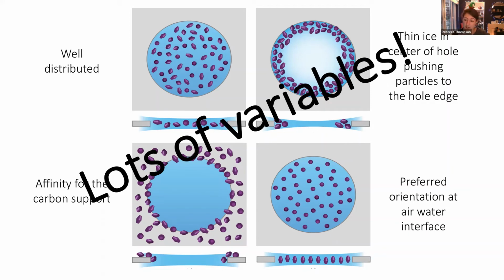And that's the advantage of accessing cryo-electron microscopy through something like iNEXT-Discovery, the sample to structure route, because that means that not only will you have instrument access, but you will also have an expert staff scientist working with you who's worked through lots of different projects and generally has a good idea of the kinds of variables that are worth altering in the first instance to try and get you to this well-distributed position at the top.